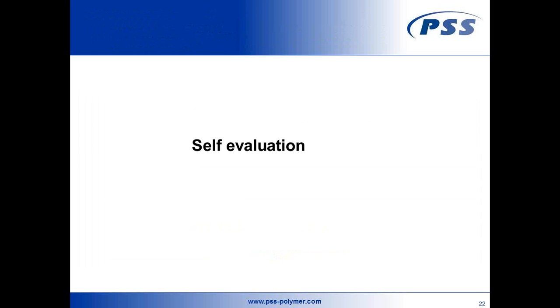So this is the point for a self-evaluation, given that I have introduced you to the method and why SEC could be useful for separating polymers and monoclonal antibodies. And now I give you a little bit of time to answer these questions.